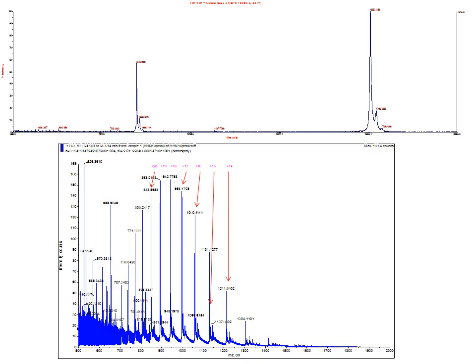To illustrate the main difference between MALDI and electrospray, we can observe these two spectra of myoglobin, a protein with a mass of 16,952 daltons. In the upper spectra from MALDI, we see the singly charged ion at 16,952, and an ion of myoglobin with 2 charges at half of that mass. In the electrospray spectra, we can see the multiple charge states of different populations of myoglobin ions.